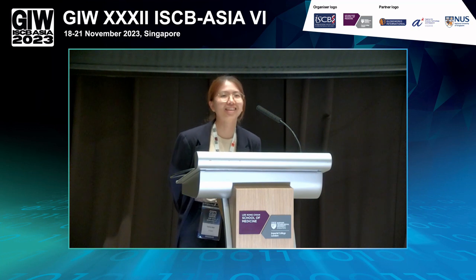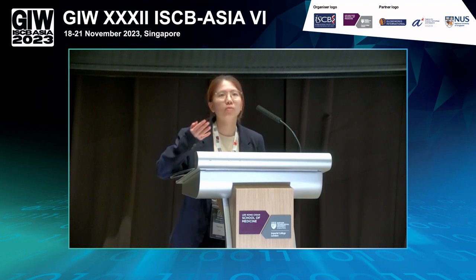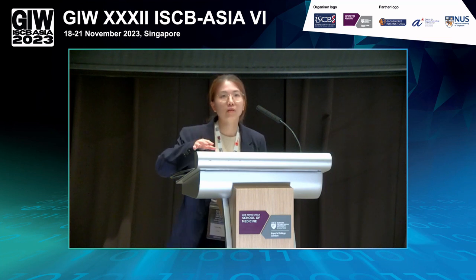Hello, thank you. Nice work. I saw that you have multiple examples of 2D image analysis. Did you try to do a 3D analysis and cell segmentation and annotation, but in a 3D space? We have yet to try that, but I think that will be really cool to do because the images that we obtain are also in 2D. If we want to work on 3D plotting, we will have to start off with perhaps a 3D modeling of our sample as well. But currently, our images are all in 2D.